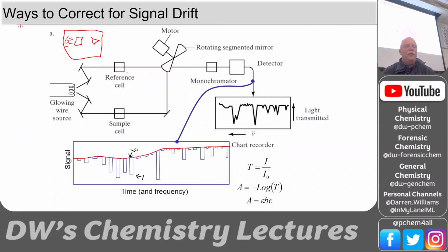And so one way to correct for signal drift is to have two paths in our spectrometer. So we've got our source here, and we send some of the light through a reference cell, some of the light through a sample cell. Now, that's pretty inexpensive. Mirrors are pretty inexpensive. The thing that is expensive is the detector and the monochromator. So we don't want to just have dual paths that have 2 detectors and 2 monochromators. For one thing, it's hard to get 2 detectors to give you the same amount of signal. So you'd have to correct for 2 different detectors.